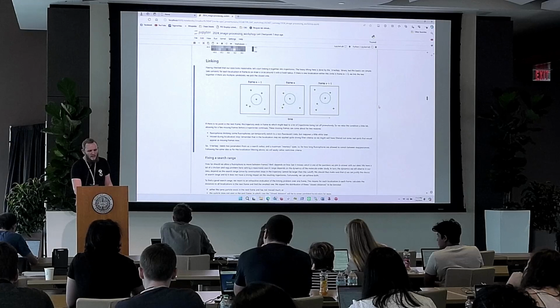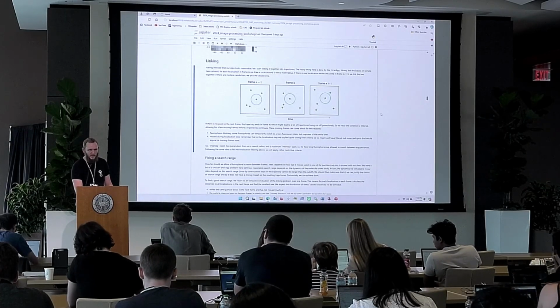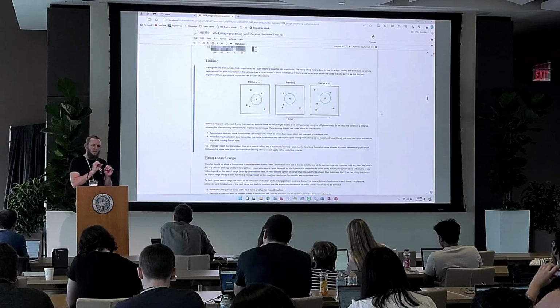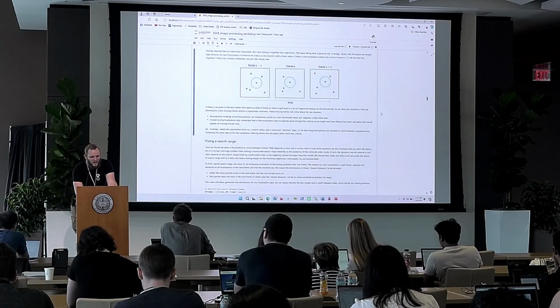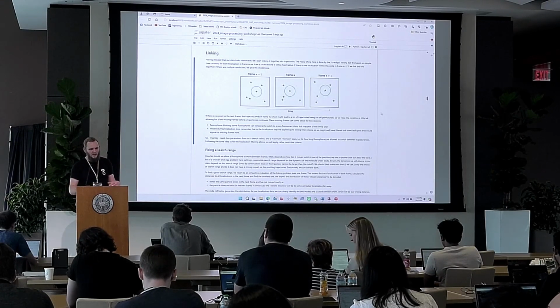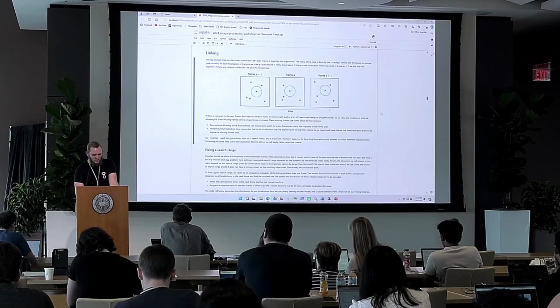contiguous trajectories. So the second thing to pay attention to when linking these trajectories is something called the memory of the linker. So basically, how many frames a particle is allowed to disappear for before you say, okay, this is where the trajectory ends. And what we're going to do now is try and identify reasonable settings for both of these parameters. The 2 parameters are the linking range, how far do we look for particles in the next frame, and the memory, how long do we allow things to disappear.